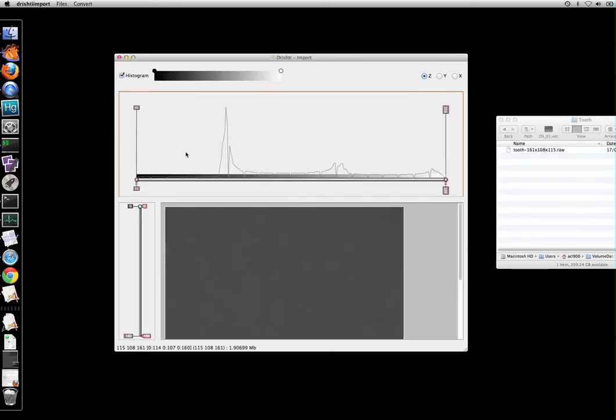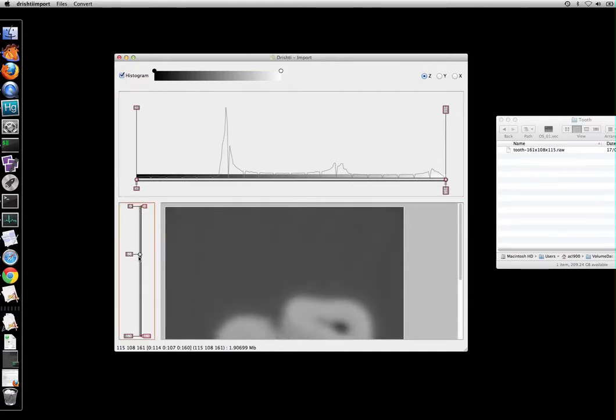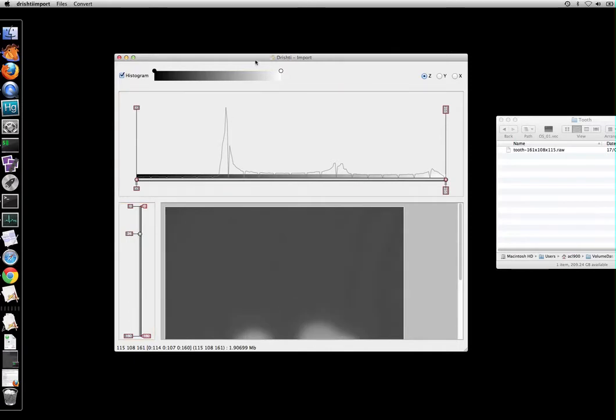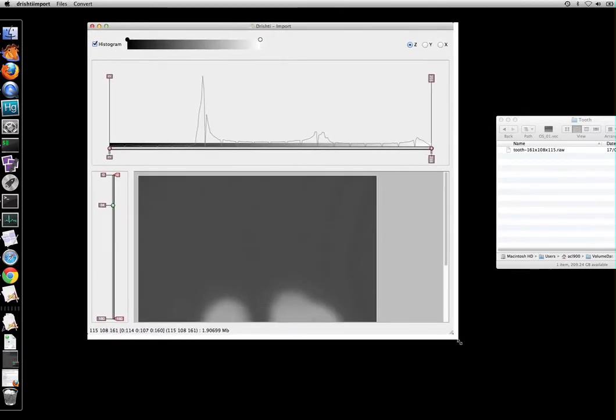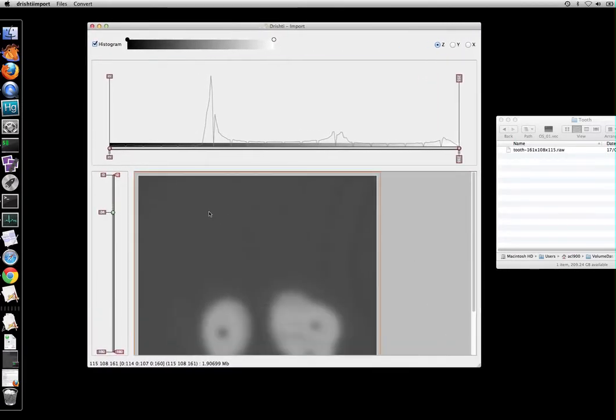Once you have done that, the program will go in and create a histogram. This is the 1D histogram of the data and this is the data. So let's just increase this box size.